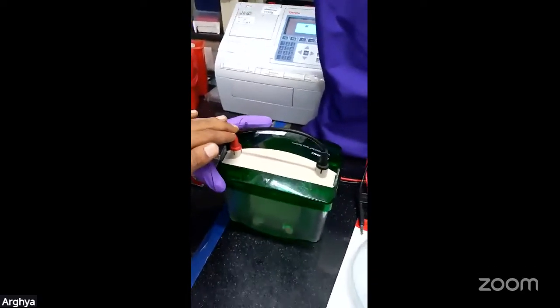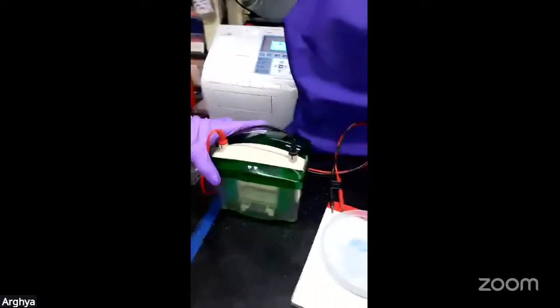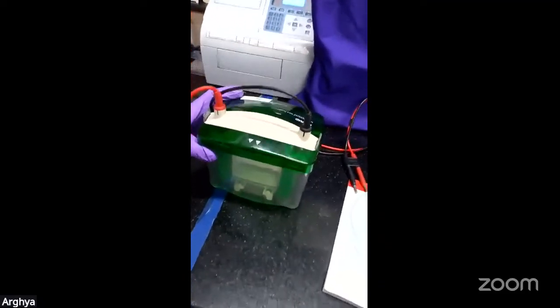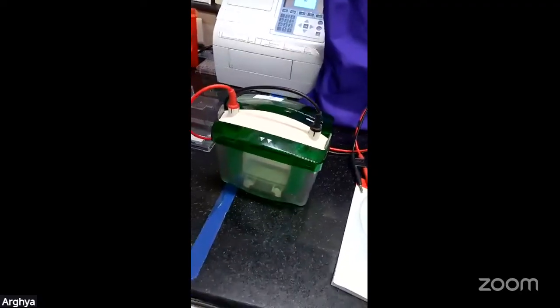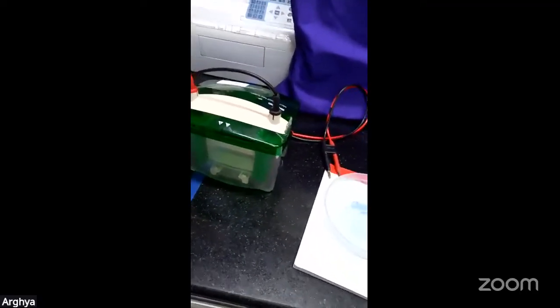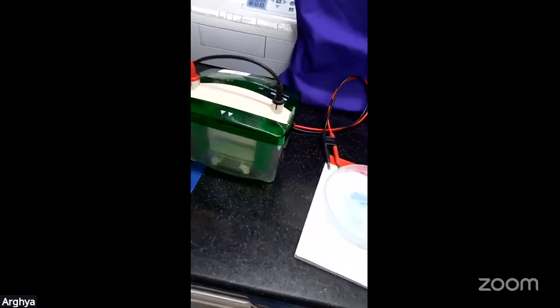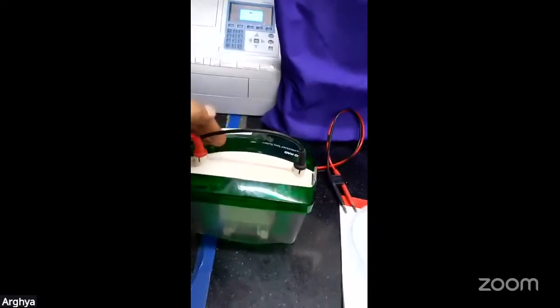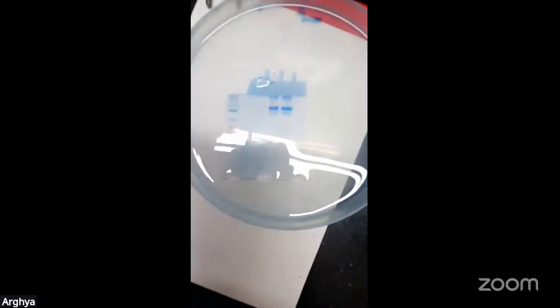So this is gel casting, and this is the running apparatus. What are the properties of SDS-PAGE? There is an overall negative charge, where molecules get separated on the basis of molecular weight. The smaller ones run closer to the bottom of the lane and the larger ones stay near the top, and you can correlate it accordingly. Once the gel is run in the apparatus, here you can find a clear demonstration of the gel.